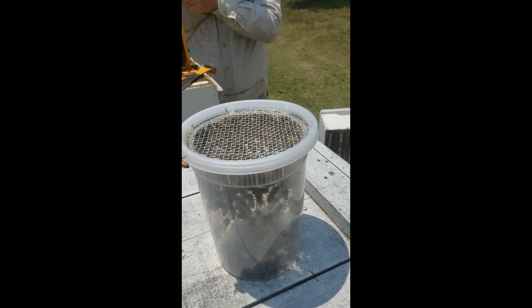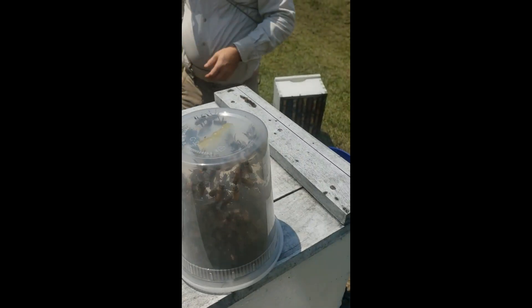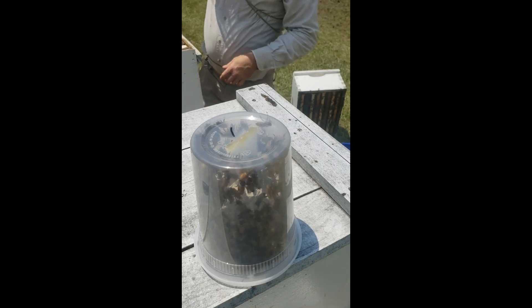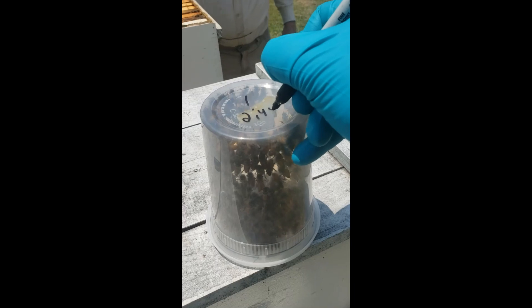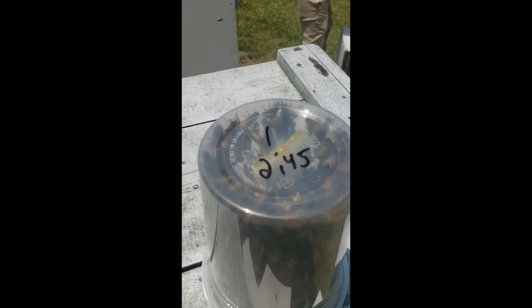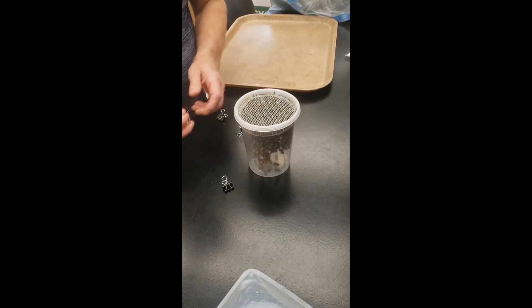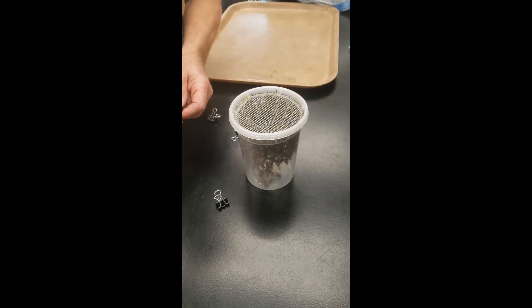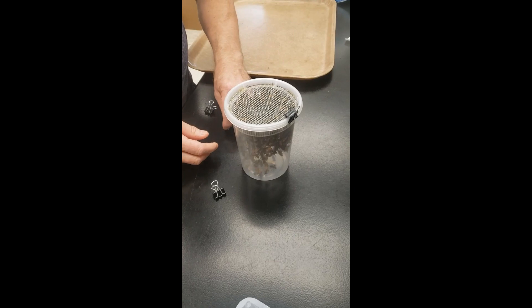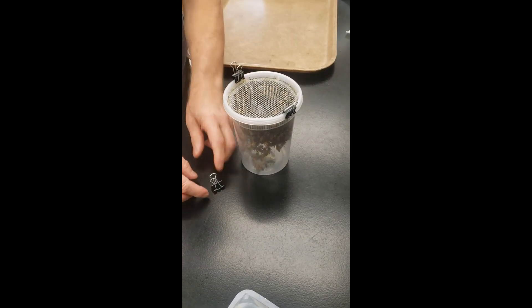That's the first step. Now that we have our sample, we have to write on the bottom — we're just going to use a Sharpie. We're going to put number one for colony number. Then the time: 2:45. That is the colony number and time on the sample. Now that we have the sample, we're going to prep it for the test. Dave is going to put four binder clips around the lid, equally spaced apart in the corners like this.